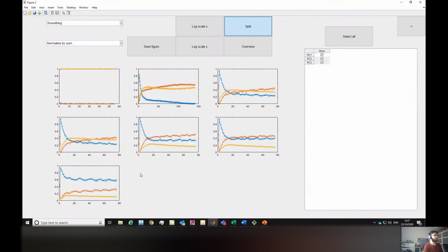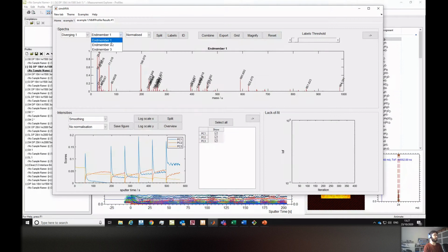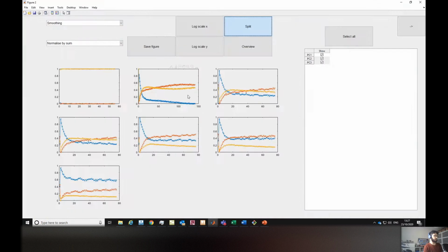So I think this is very powerful, especially when you have several samples and you want to compare things. So it helps on giving you the confidence on your assignments afterwards. For each of these colors, you know the ions, so you can go back to them and make assignments based on their correlations. And also it helps on visualization, like presenting this data in this way is much clearer than just trying to show the processing of each of those separately.